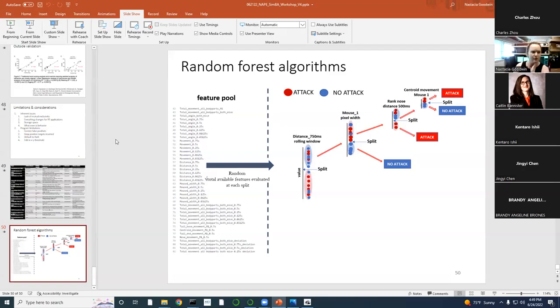Yeah. And we do have ways to switch the directionality of classifiers. I went through and made all of my classifiers so that my white CD1 is fighting against the black C57. But we wanted to switch and say, okay, what if mouse 2 is fighting against mouse 1? We have a button that says, I think, directionality swap. And you can use that to switch directionality so that you don't have to annotate another full training set.